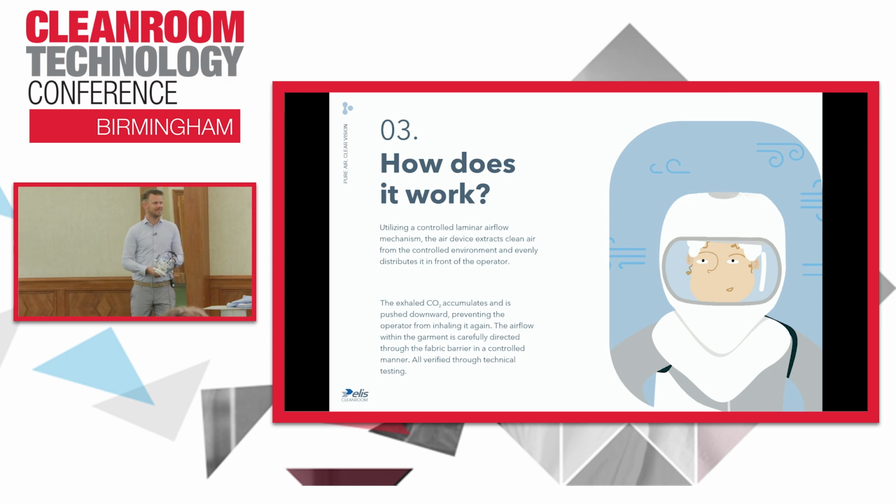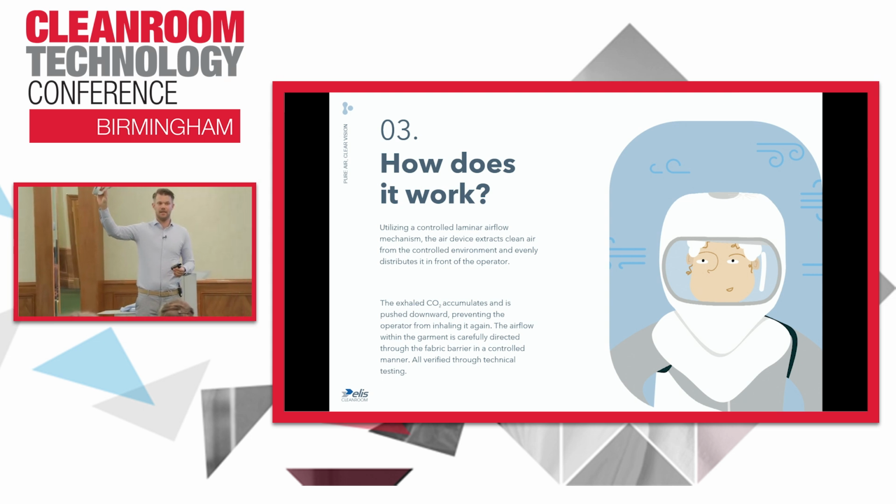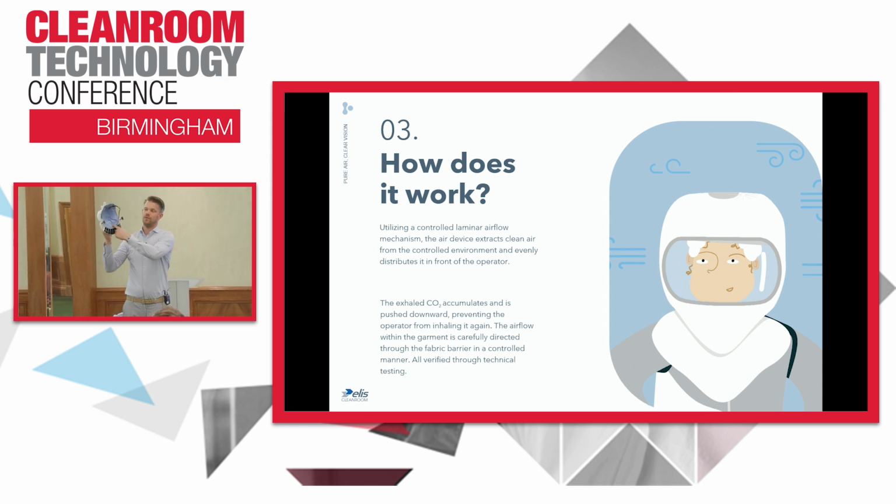How should I do this? So this is the helmet. It's only this and this, battery and a helmet. And inside we have a textile, because of course it's a polycarbonate system, so it's really firm. If you push it really hard onto your forehead, you still get these pressure points. That's why we created a kind of cushion, a textile that can be fitted in many ways onto the helmet on 5 fixation points.